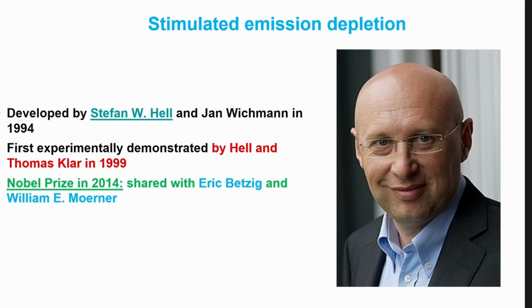The most popular one that you will most likely encounter is STED microscopy, stimulated emission depletion microscopy. What does it mean and how was this discovered? We briefly talked about it before lunch, but this was really just a bit of a verbal introduction. It was developed by Stefan Hell and Jan Wichmann here in Germany, and they did get a Nobel Prize for it 12 years ago. It was a big buzz in those days.